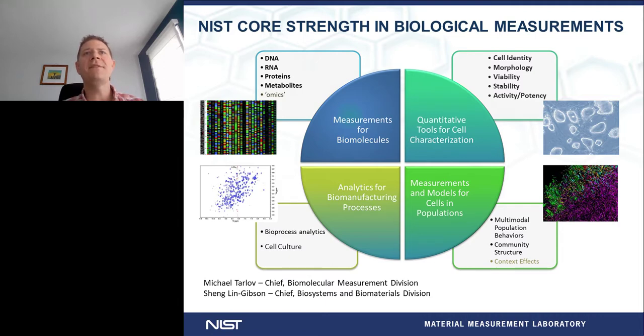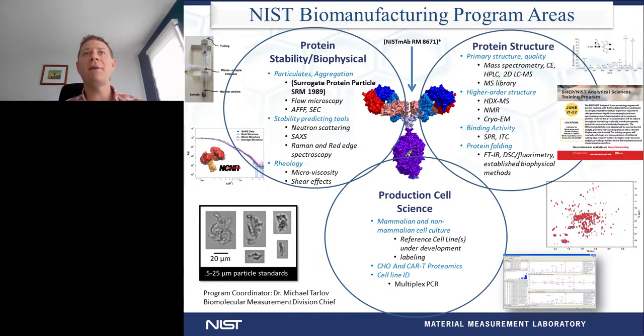So with that measurement system, we've actually had a program specifically in biomanufacturing. So now we're kind of getting into the protein therapeutic space, which is where we spent approximately the past 6 or 7 years. Again, we have a very wide program, but this is focusing mainly on the monoclonal antibody type characterization and analysis that we've done over the past few years.